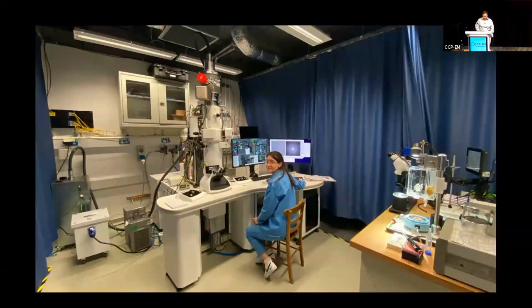So this is an entirely built from scratch new gun. This is the 4th prototype of it. There's going to be a 5th one coming soon to us, and hopefully that's the one that could be put into microscopes that you might buy sometime soon.